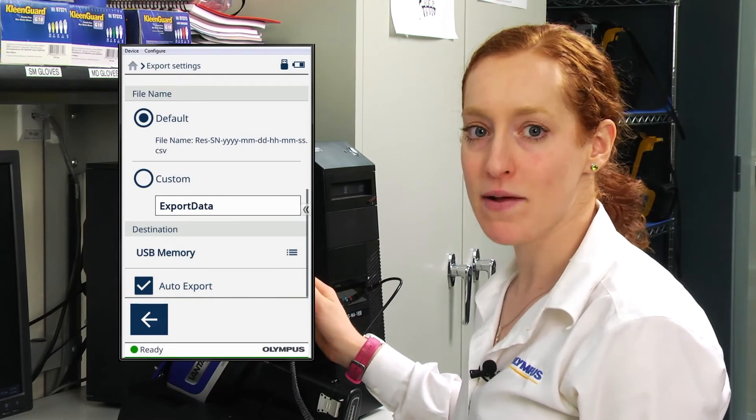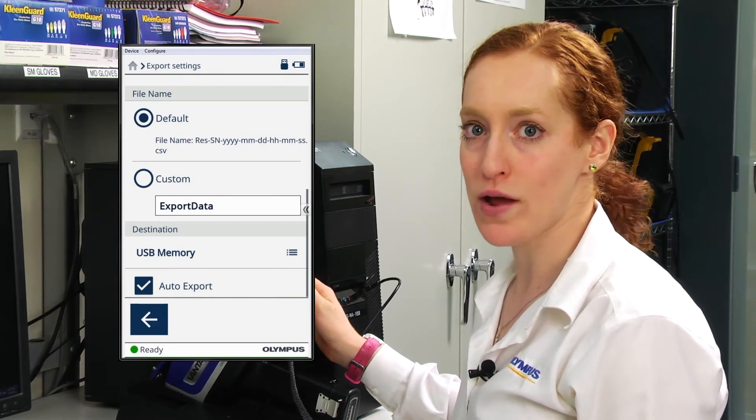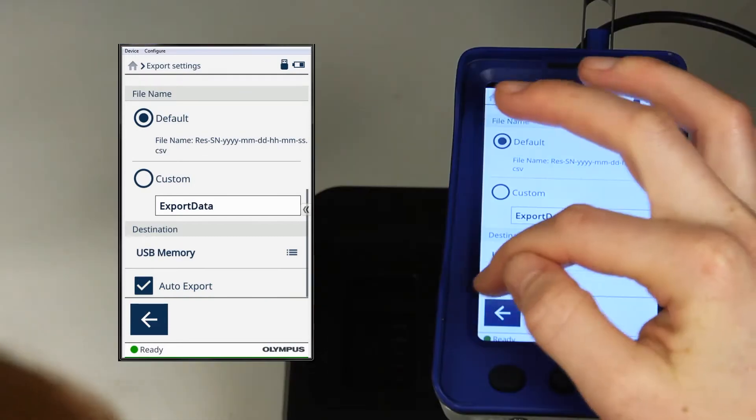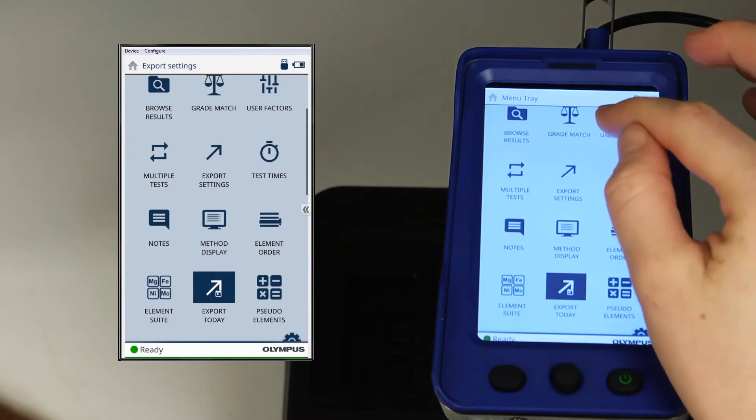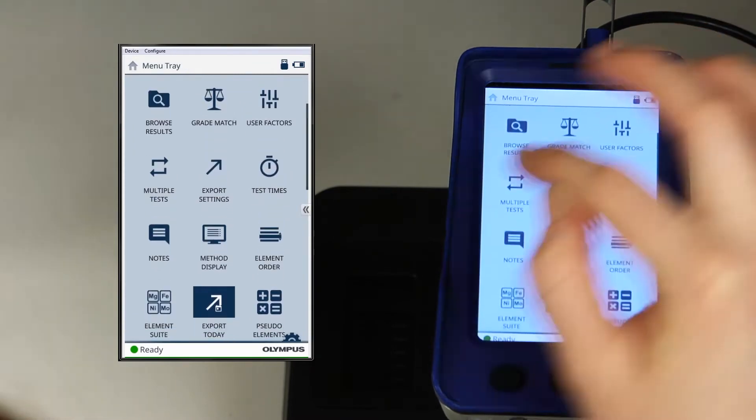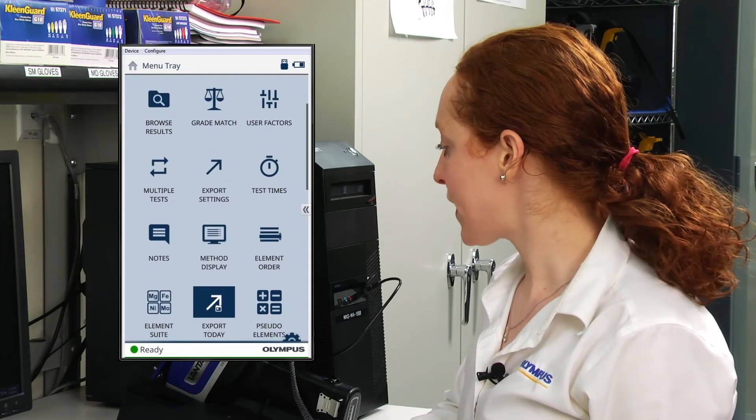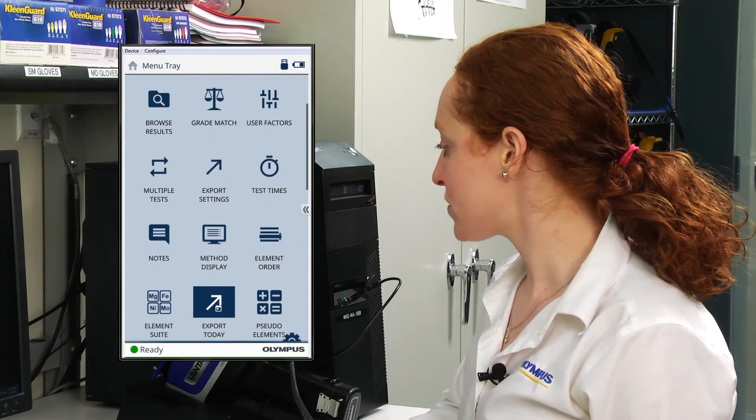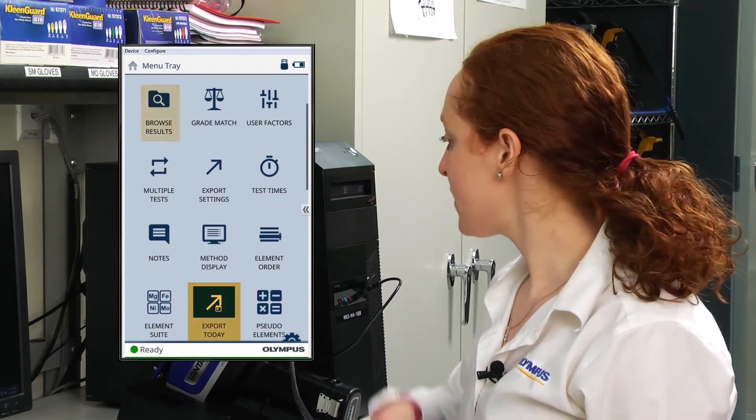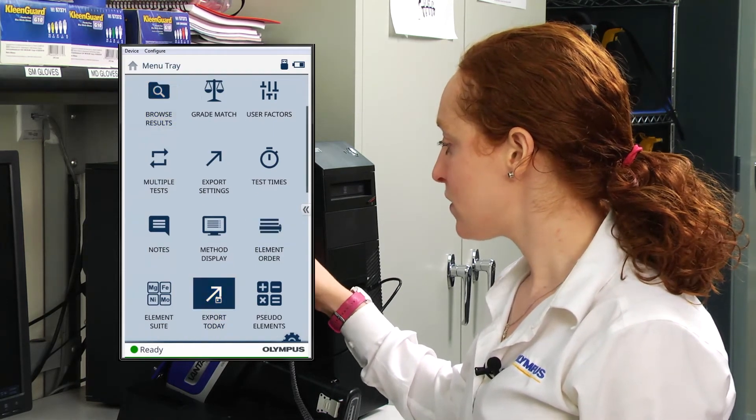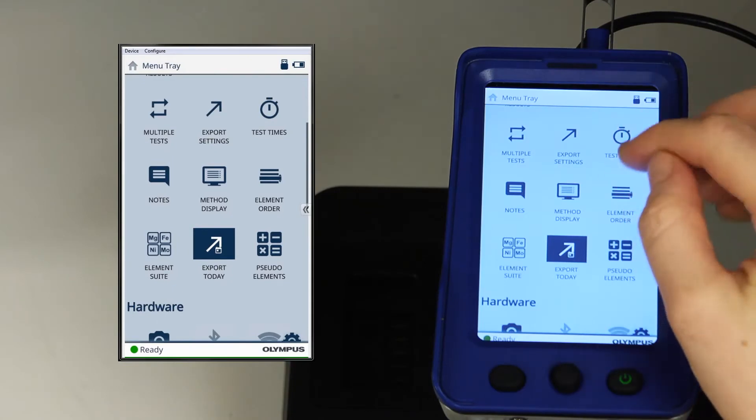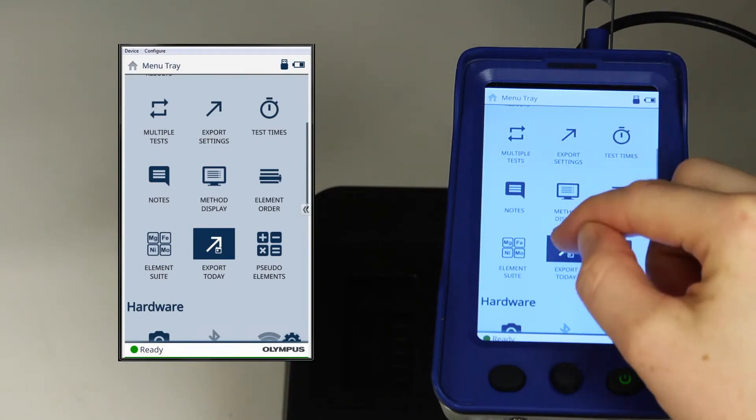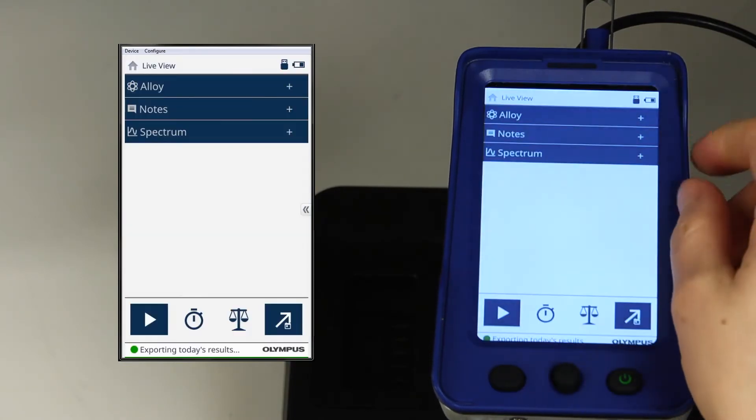Once I have my export settings configured the way I want them, I'm going to go back to my main menu. I have two options for exporting results: Export today and browse results. Clicking export today will automatically export all the results from today's analysis.